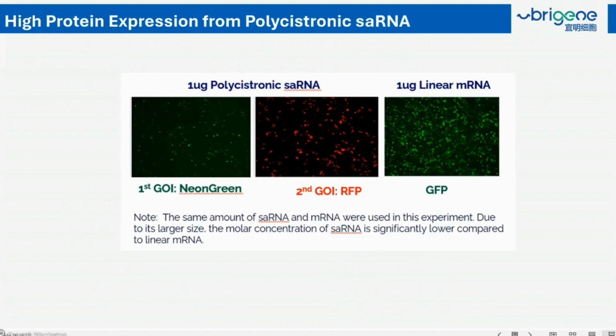our linear mRNAs as well as our polycistronic saRNAs have robust expression of the delivered proteins using our LNP.